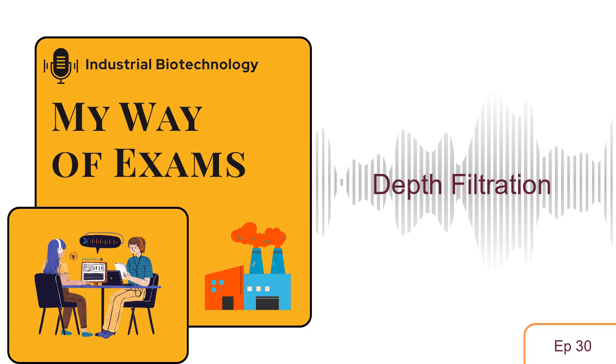You think about trying to filter something like, say, muddy water. If you just had a thin cloth, it'd clog up super fast. But a thick filter, a depth filter, can actually hold a ton of that sediment, all that dirt and stuff inside of it. And it does this through a few different mechanisms. Okay, so it's not just about size exclusion like a sieve then. It's more than that. It's a combination of things working together.